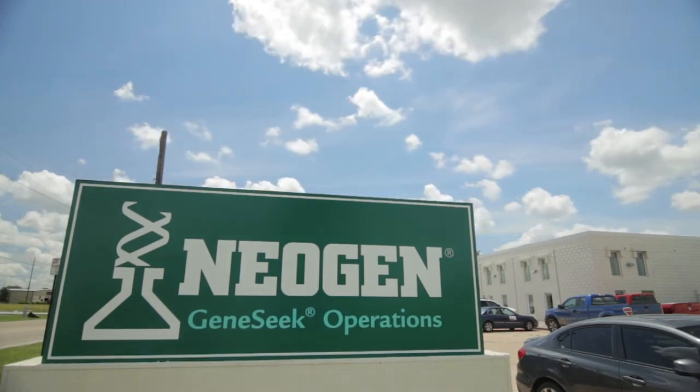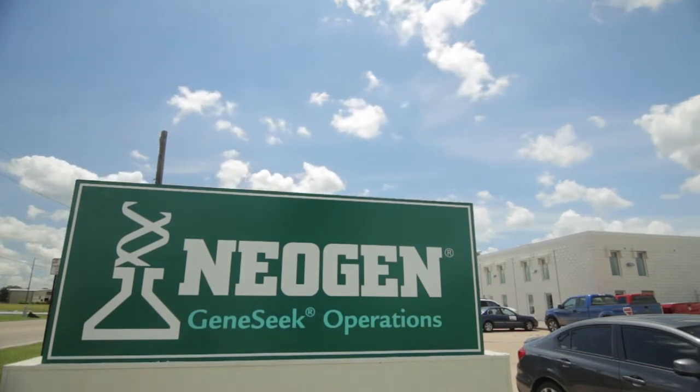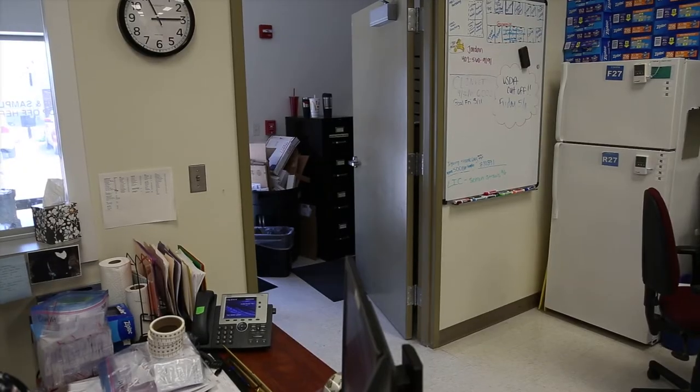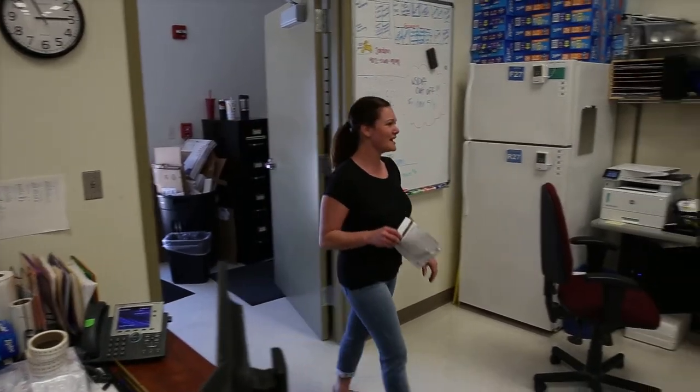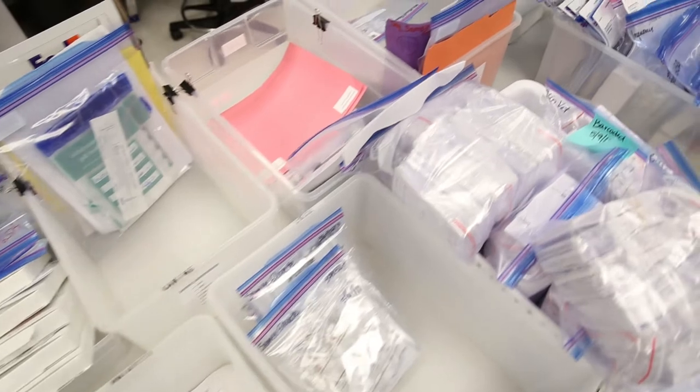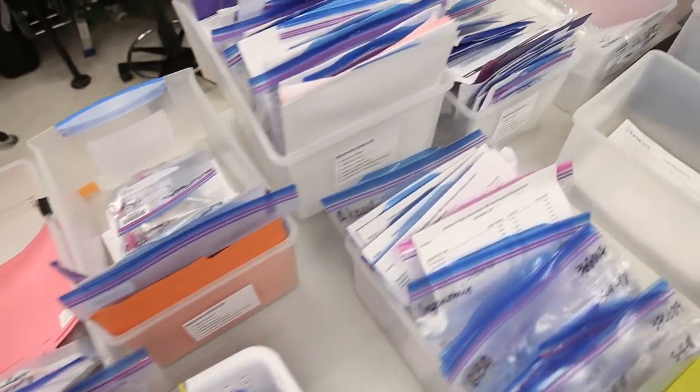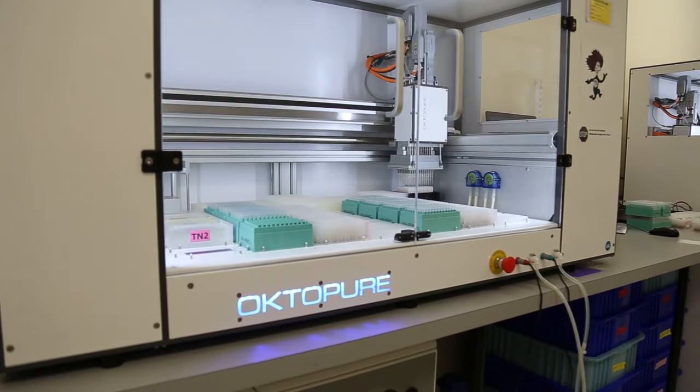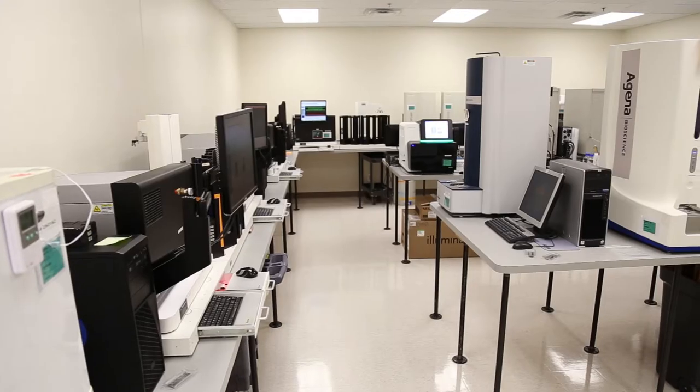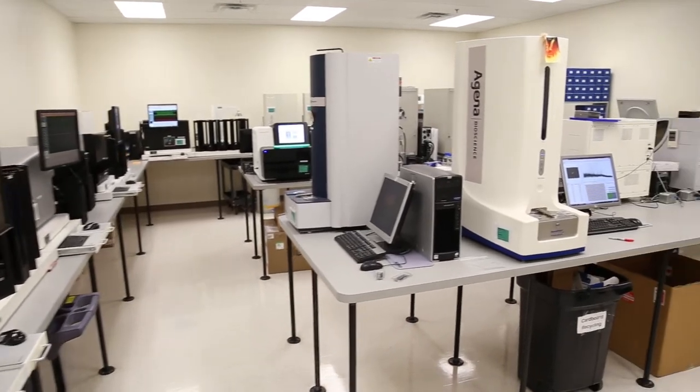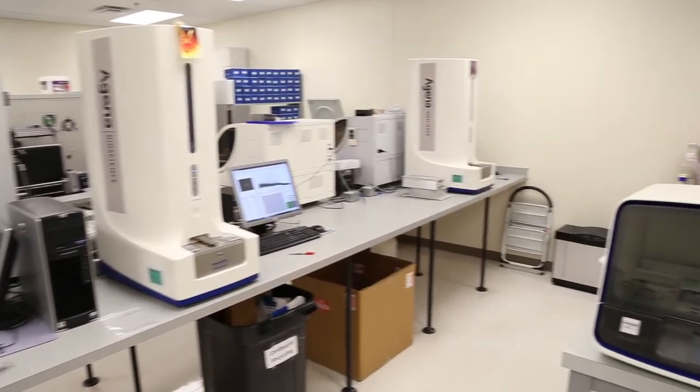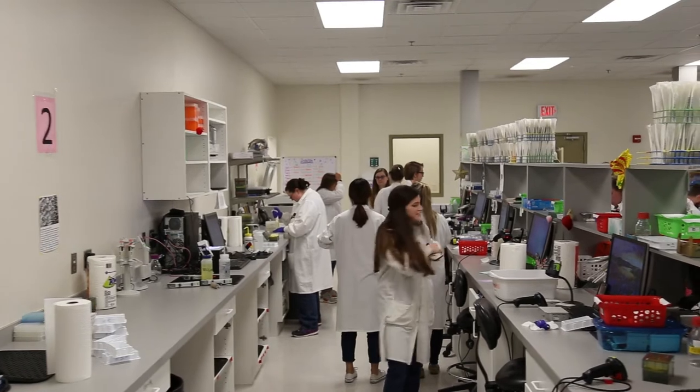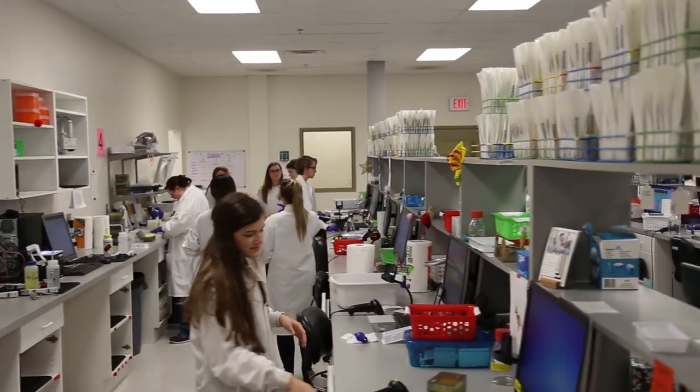Welcome to Neogen Genomics, the global leader in DNA testing for animals. Each day, our lab receives tens of thousands of individual animal samples from customers all over the world. Our lab uses some of the most advanced technology available to read the code of DNA, the blueprint for life itself, to predict how it influences the well-being and productivity of animals and the people who care for them. This tour provides an overview of how this process works.